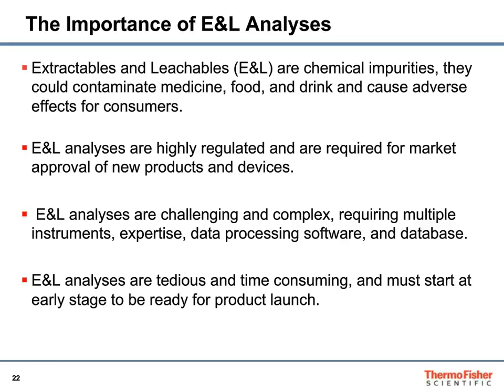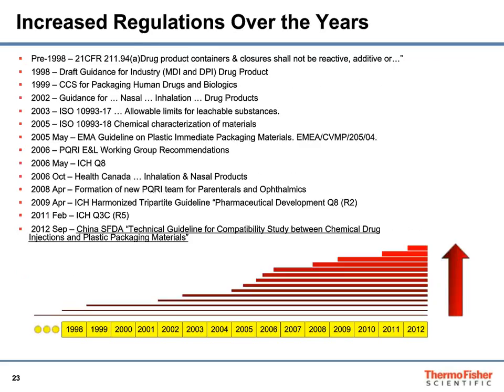And last but not least, E&L analyses are tedious and time-consuming. You must start at an early stage to be ready for new product launch. Over the years, there are increased and more and more stringent regulations from all over the world, especially in North America and European countries.